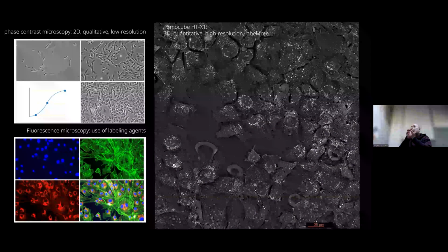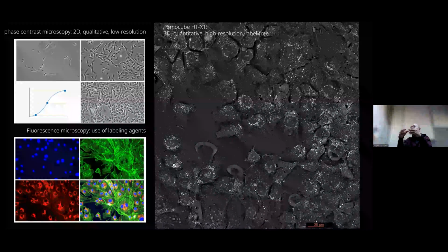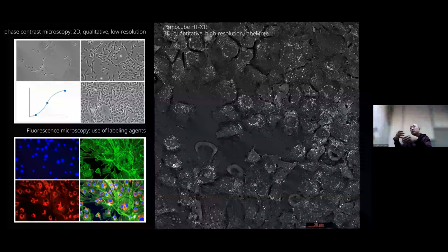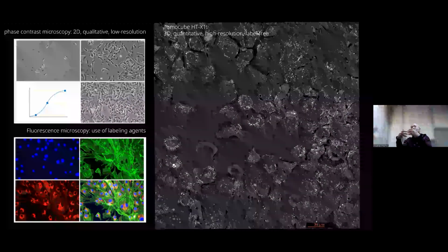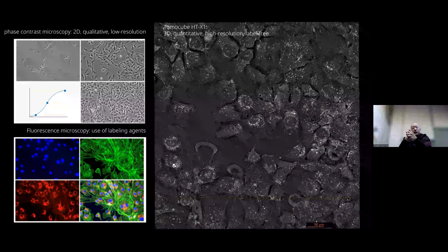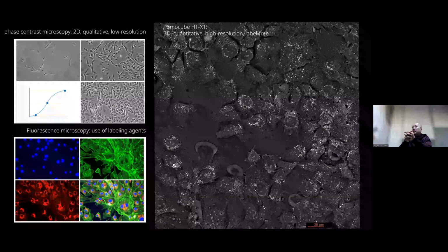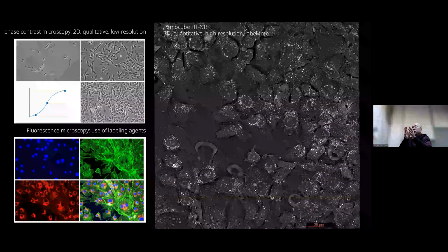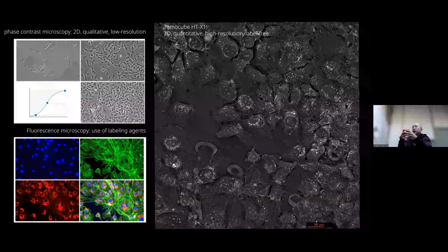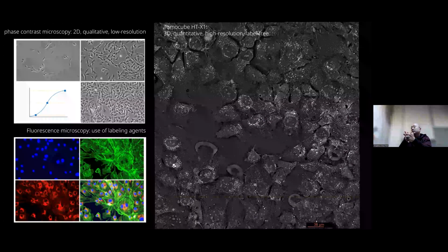But since we are developing segmentation methods optimized to the holotomography data, it may work on other data formats and other imaging techniques, but the accuracy may not be very high. So I believe for a specific application of a specific technique, you need to optimize. You need to develop the algorithm independently. But I think this is a very intriguing question.